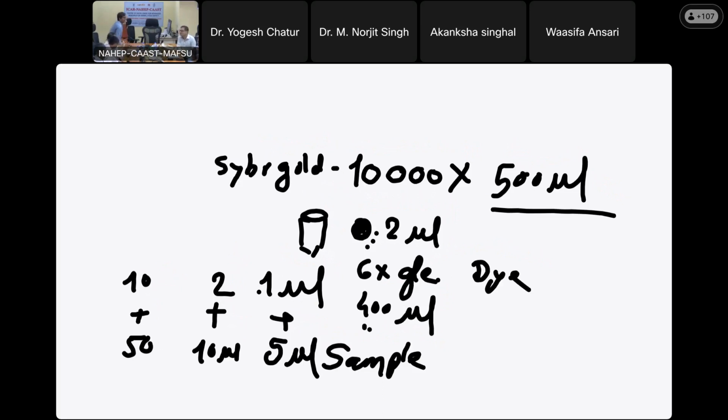So, the steps involved in Sanger: do you want to do Sanger sequencing in your laboratory? You can do it, no problem. It doesn't need anything actually, and it is extremely cheap. The Sanger kit, the BigDye Terminator kit, comes with BigDye 3.1 terminator.